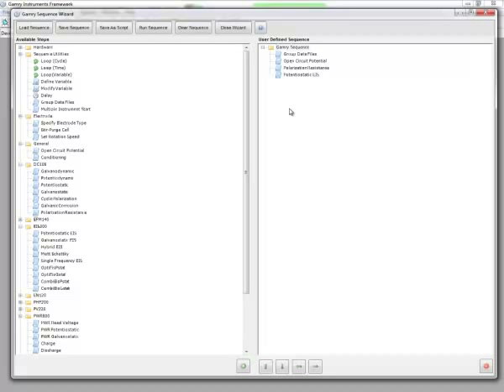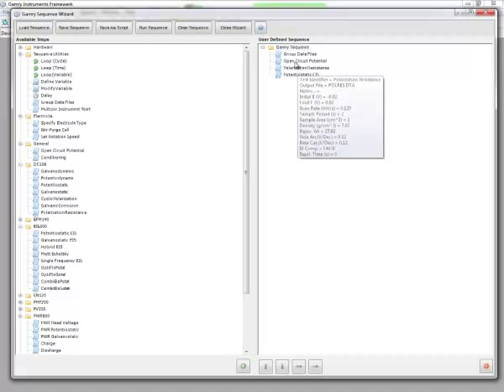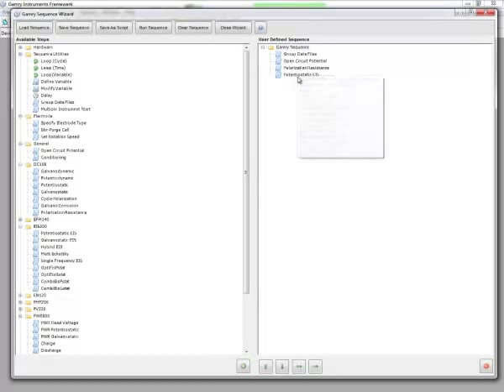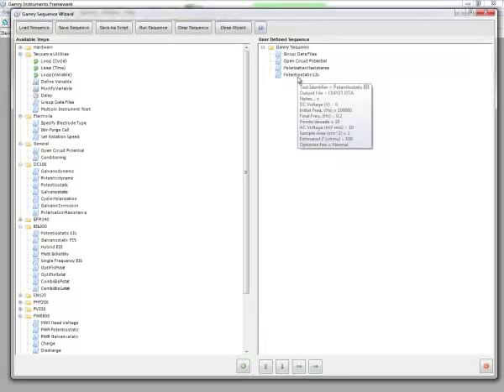As we can see, the last sequence that I ran was the basic sequence, where I simply ran open circuit potential, polarization resistance, and potentiostatic EIS.